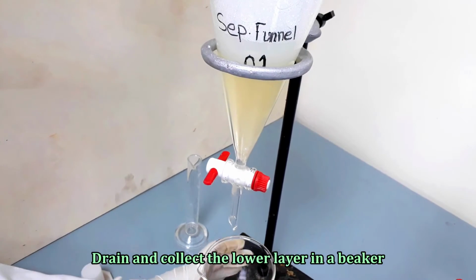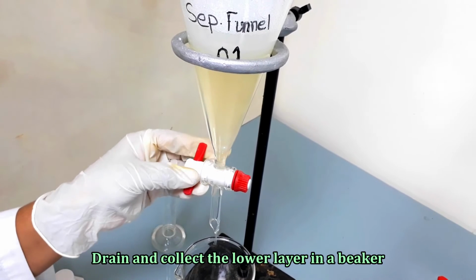Drain and collect the lower layer and pour the upper n-hexane layer into the separating funnel 2.